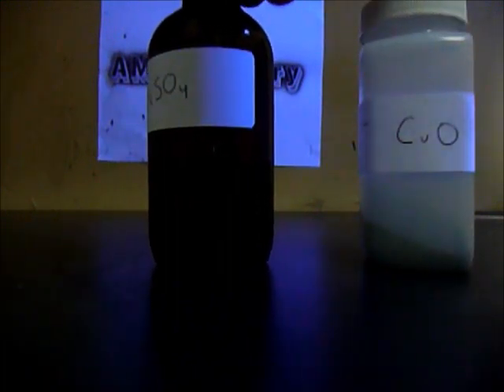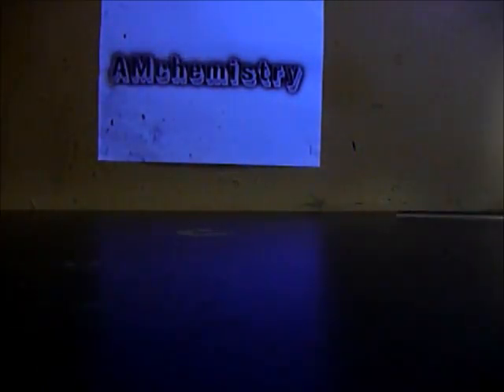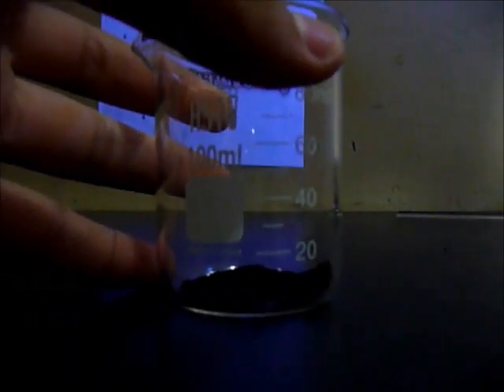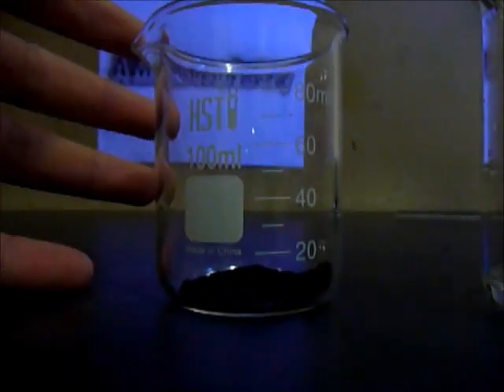I got my sulfuric acid from car battery acid so it is not really concentrated. So I'm using about 1 and a half grams of copper oxide and I am using about 10 ml of sulfuric acid.